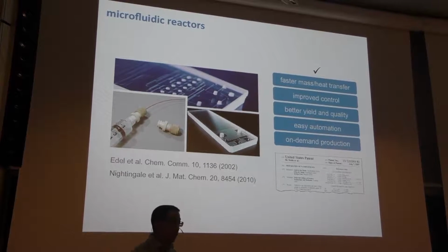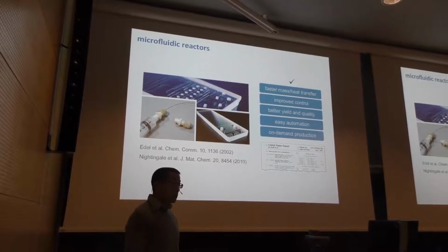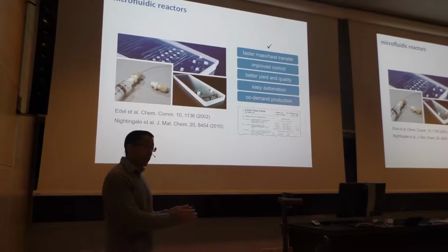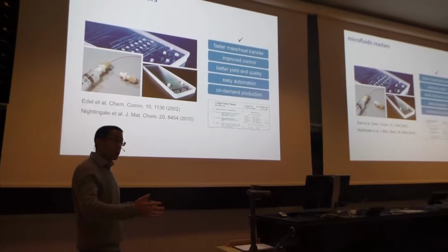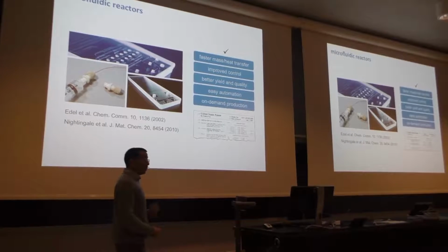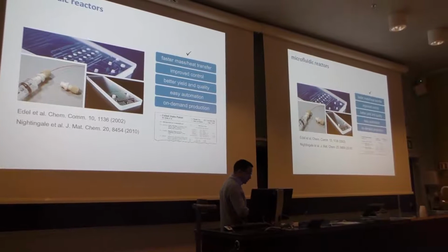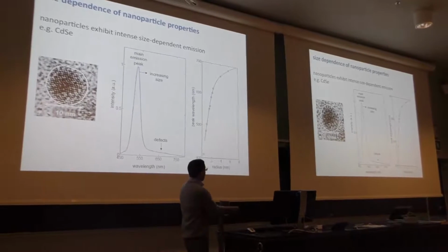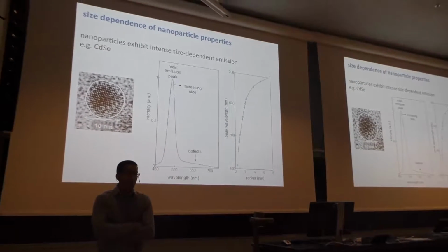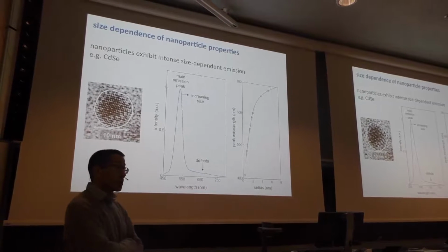So one of our goals in my group is to develop chemical systems that are completely self-contained. So they'll carry out every single step of a chemical synthesis in a single inline process. And I wouldn't say we're there yet, but we've certainly been developing many of the tools required to achieve that goal. So to give you an early example of some of the work we did in this field, we started off by trying to synthesize quantum dots.